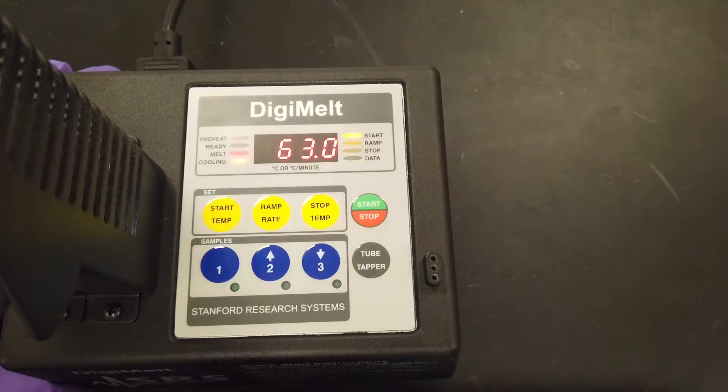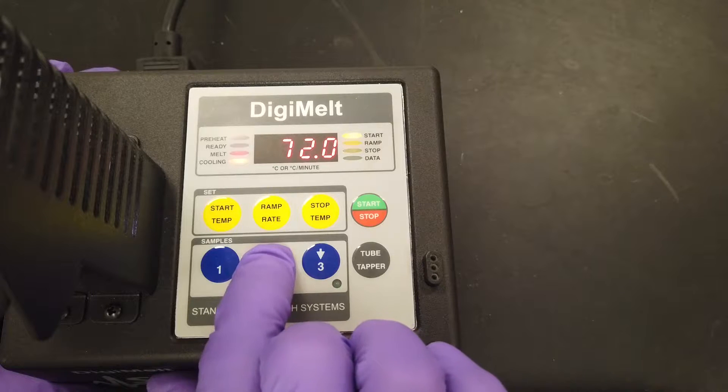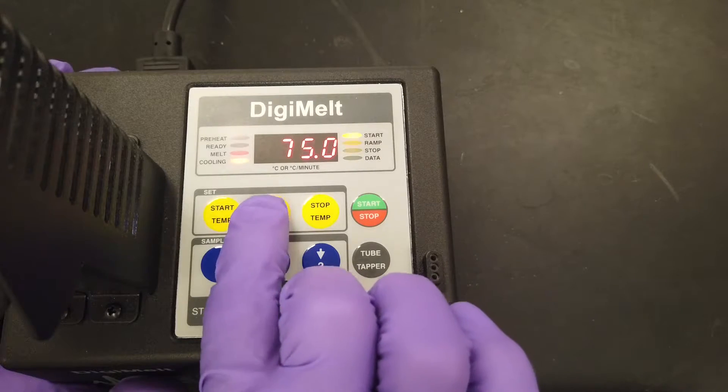Setting the parameters. First, select the starting temperature by pressing the start temp button. Then press the up or down arrow to the appropriate starting temperature and press start to confirm.